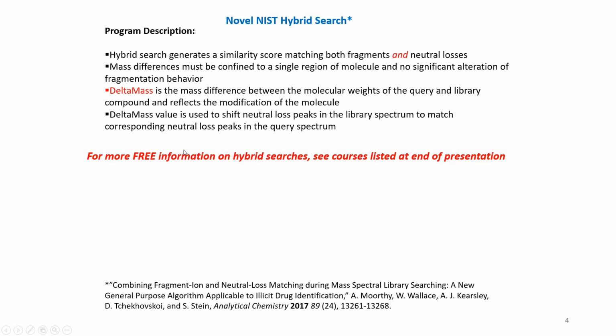More free information is available in the hybrid searches and courses that are listed at the end of my presentation, and the description of the hybrid search came from the article that is shown from the NIST laboratory at the bottom of the slide.